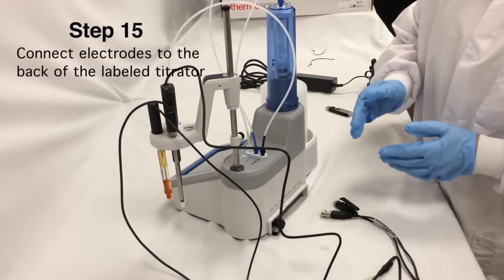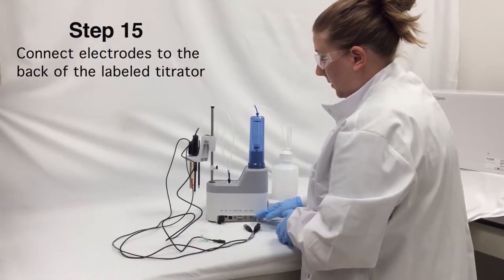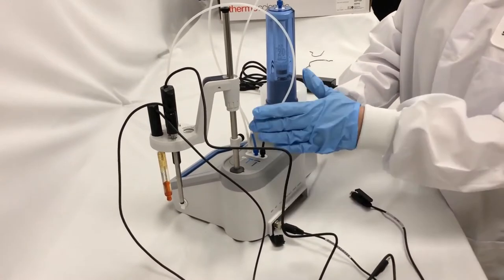Next, I'm going to connect the electrodes that I just placed in my holder to the back of the titrator. I can see that it's nicely labeled, so I just need to follow the connections.